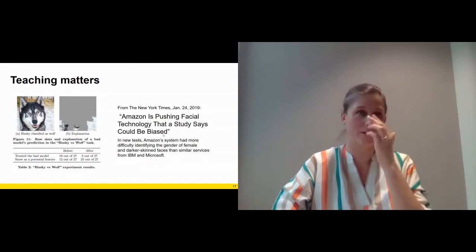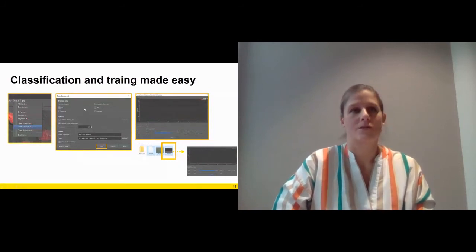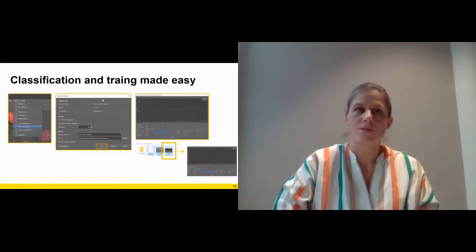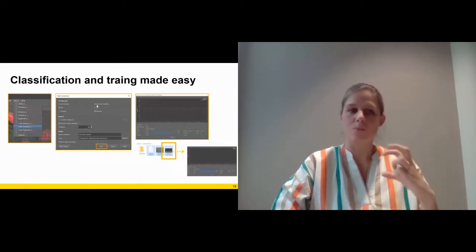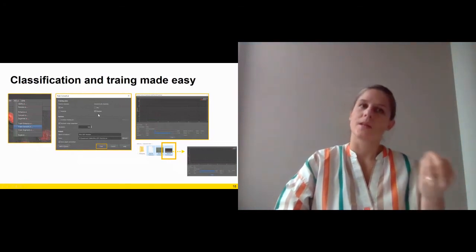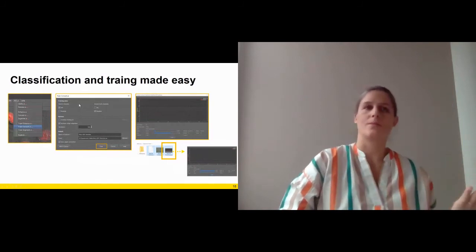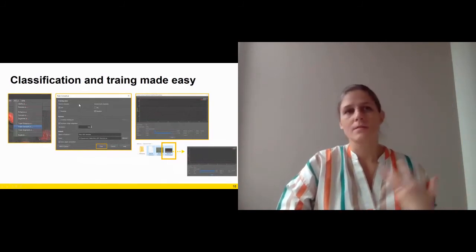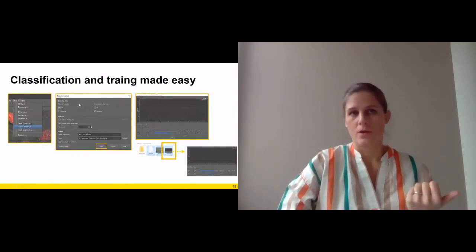So when you go to our software, in the menu, there is the training part for the algorithms. And in the training part, you just have to select your source channel and your ground truth channel. So basically, the two channels, the input and output pair for your training. We just want to emphasize, please take good care that you choose a statistically relevant overview over your sample. And then you can choose the iterations, but the value of 500 is already quite good. And then you say where you want to have your output saved, and then you can train your algorithm.